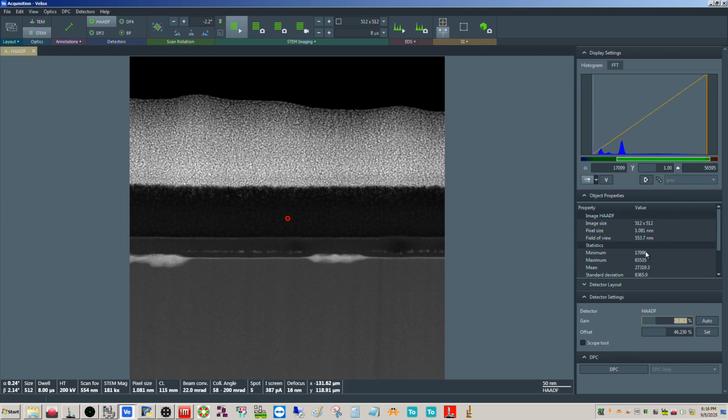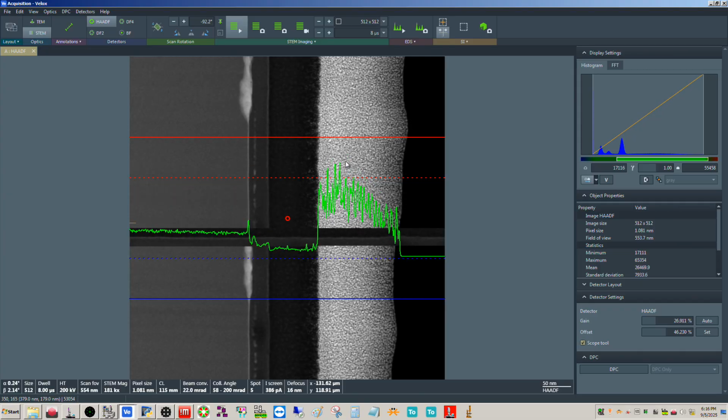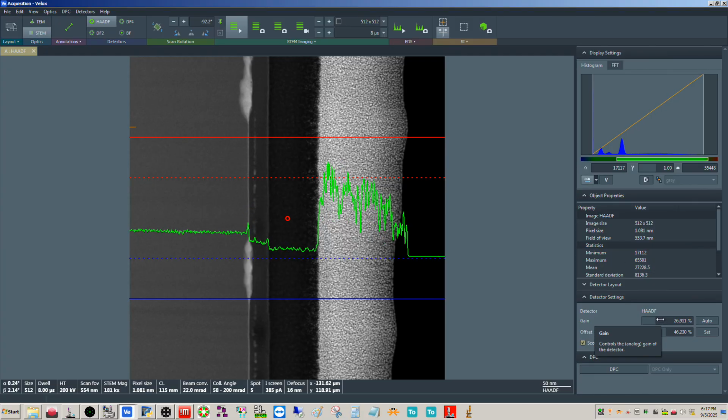So again, you wouldn't want to rely on that, and if I turn on the scope tool, even though this doesn't show that, it actually kind of does. You can kind of see, like, intermittently it kind of spikes and hits the solid red, okay? So you do want to pay attention to this number, just to be on the safe side, because you don't want clipping in an absolute sense, meaning you've hit the peak limit of the detector, which in this case is 65,500 counts approximately, okay?